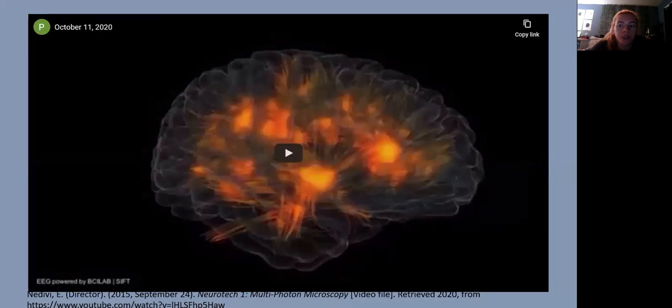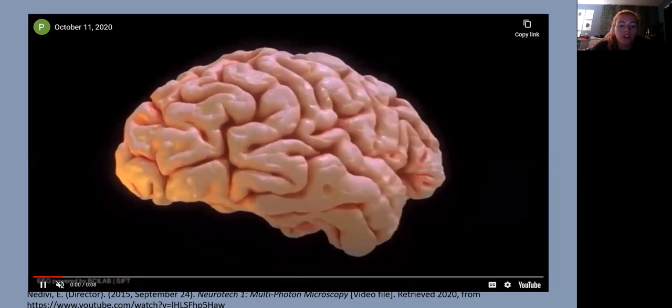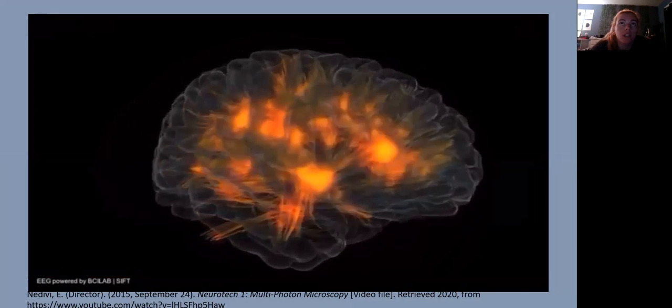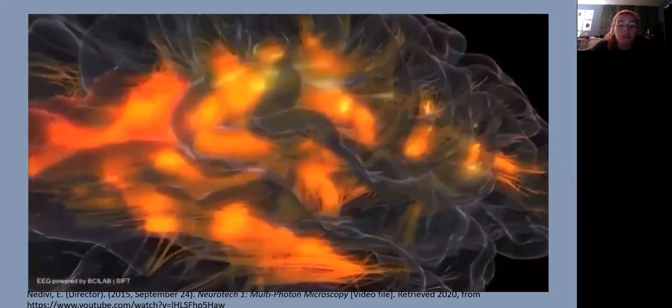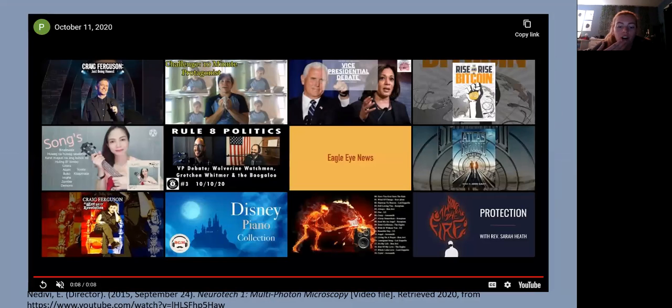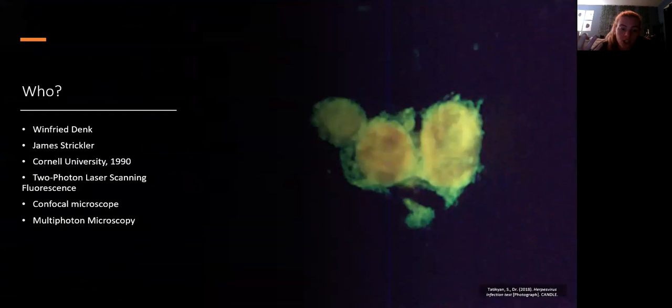This newer, non-invasive way of monitoring provides direct quantitative biomarkers that reflect adipogenic cell differentiation and tell you the metabolic state.